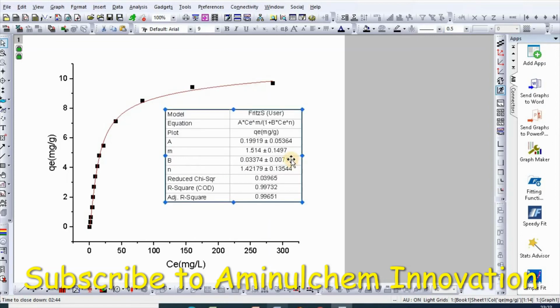So here are our Fritz-Schlünder parameters, where A is this, M is this, B equal to this, N equal to this, and R square is 0.997.